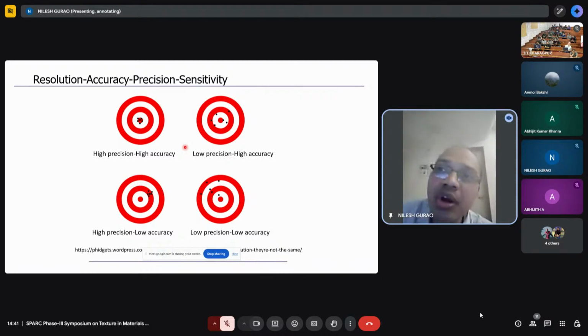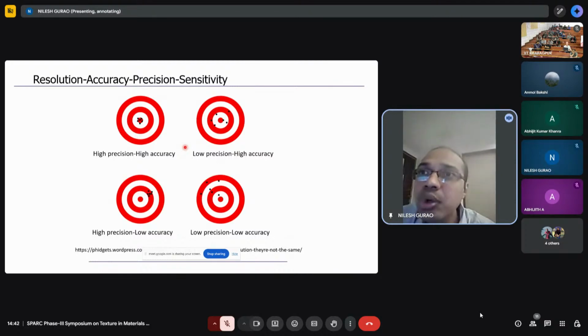So someone working on nano nickel, who is depositing nano nickel by electrodeposition and getting a grain size of 20 nanometer, cannot do EBSD. You should be aware of that, because that is well below the spatial resolution of electron backscatter diffraction. At the same time, if I'm going to talk about a subgrain, where the difference between the orientation is like 1 degree, 1.5 degree, I can't do that. I may do that in a TEM, but in EBSD, my angular resolution is 1 degree, right?